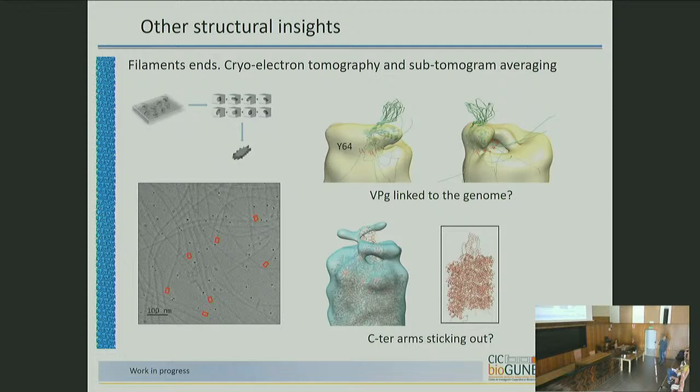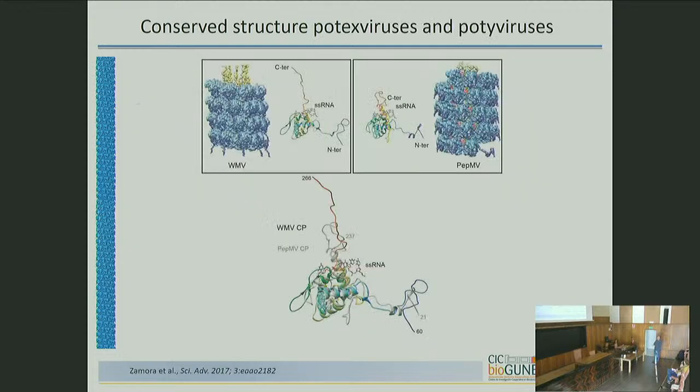And this crazy thing, the only thing that we can think of is the C-terminal regions, which we know reach higher levels in the turn and are exposed directly to the solvent. We don't know whether this is real or not, so we need to add more data here. So, conservation: those are the Alphaflexiviridae family, a Potexvirus, and the Potyviridae family, a Potyvirus, and they have the same fold.